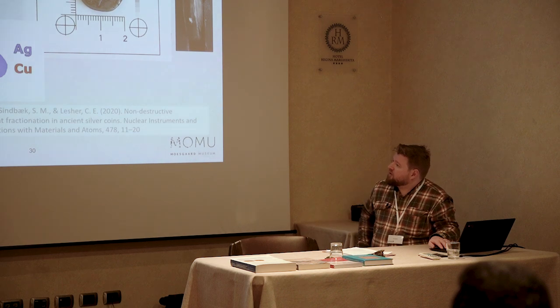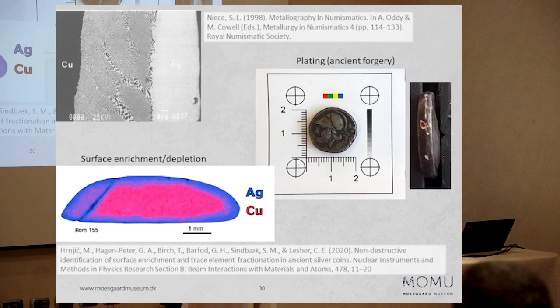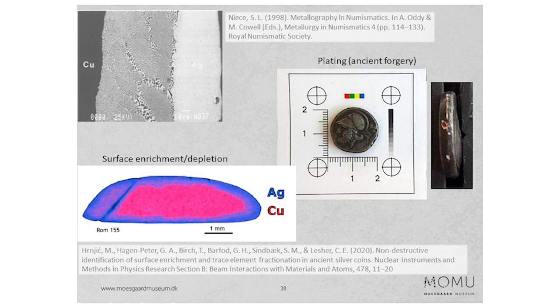Up above they can be up to, as you can see here, 0.5 millimeter. I say this because it's something in our community that we discuss, but when you advertise doing non-destructive analyses with lasers on the surface, it sounds fantastic. But if you can't penetrate into the core, what is it you're actually sampling? What is it that you're representing? So we do try and go, and this isn't always a problem, but if you know it's an issue, you have to get around it.